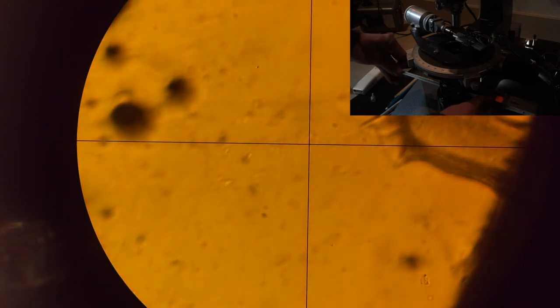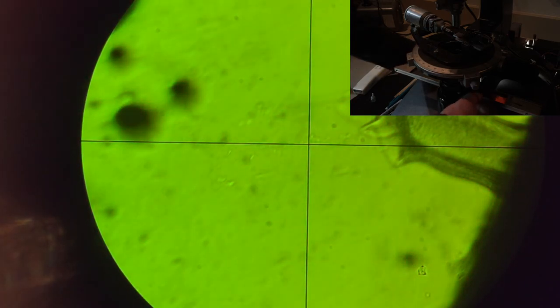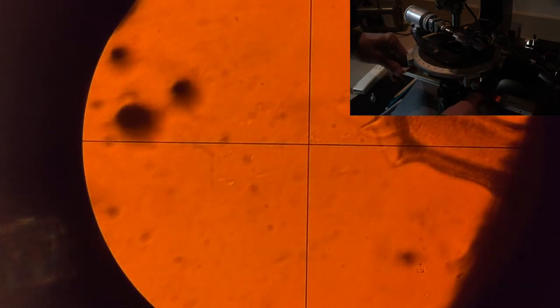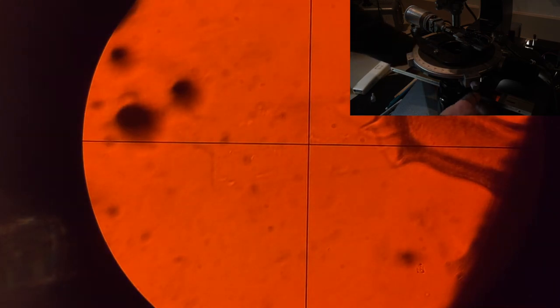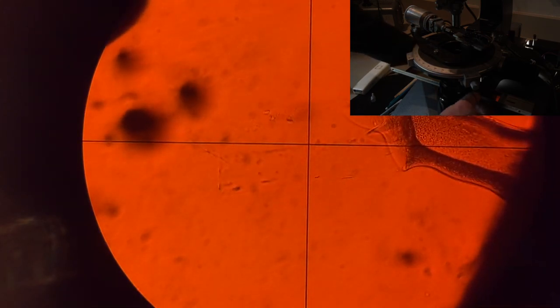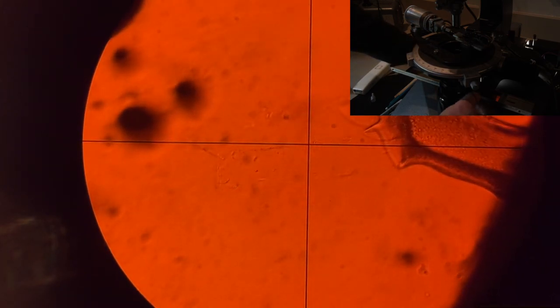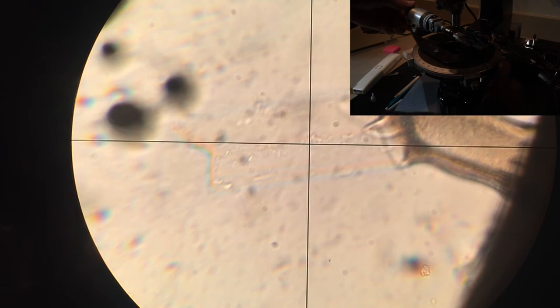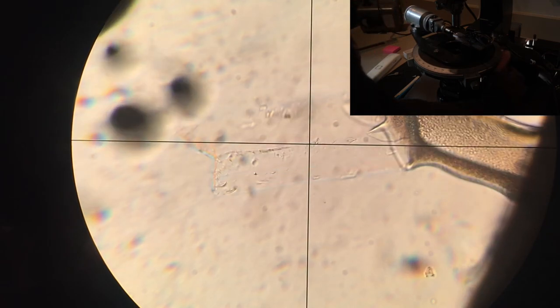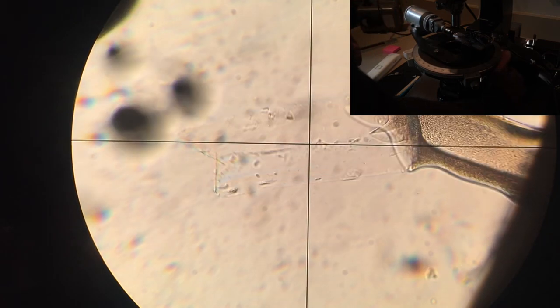Then I would record what the Mazort number is reading on the right side of the slide monochromator right where the edge of it is. That's a pretty good match, but that's why I like to blur the crystal a little bit by lowering the stage is I could see the fringe and how it changes as I move across it. That's why this is probably the best way of doing this other than measuring something with lasers or something like that. You could see it in real time as you move the monochromator.